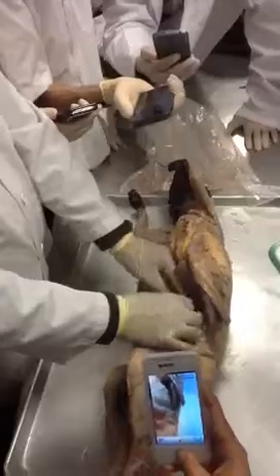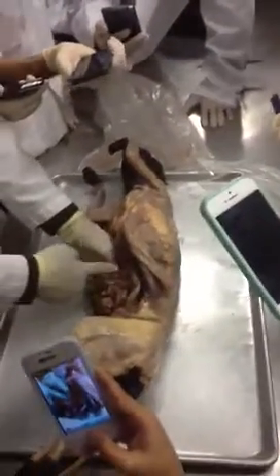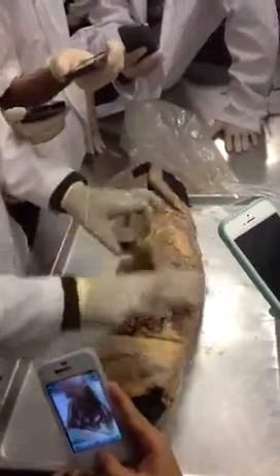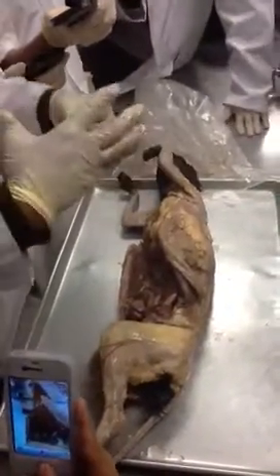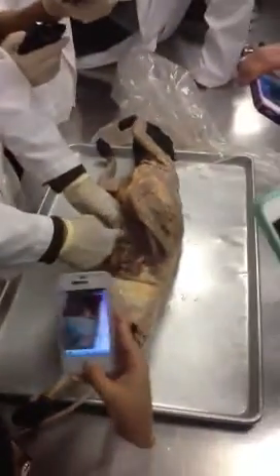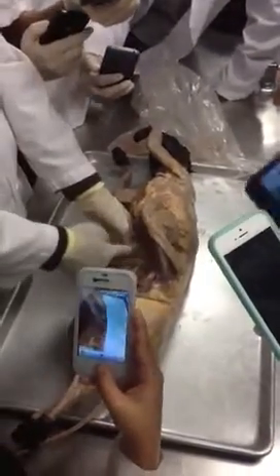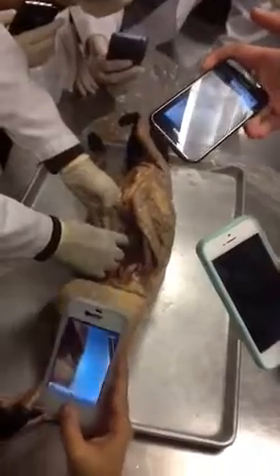They are of course connected, but the thing is, the small one got inside the large one. Not like a same tube, not the smaller one gradually getting bigger, no. The smaller one got inside the large one. Yes, there is a valve actually between them, so nothing from the large intestine can come back to this. It's called ileocecal valve because this part of the large intestine is called cecum.